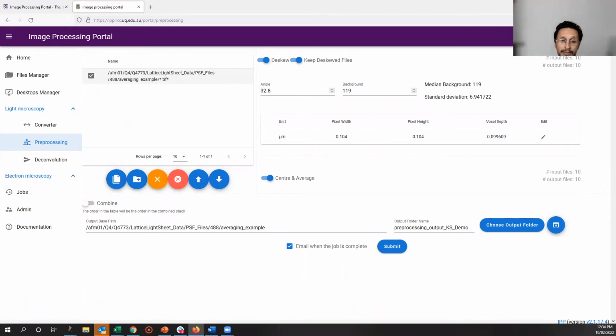He was asking about doing the deskewing, and in his words, I'm sort of parroting him, I don't know what it really means, he was talking about the deskewing and also creating a MIPS file to double check. That was his first quality control pass, and if it passed that one, then he'd be happy to continue doing the processing. I'm just wondering, is this a similar situation that you're seeing with your wet lab researchers? And if so, is there any automation, or is that part where Hoang is going to be talking about, to be able to check that data quality before it gets moved across?